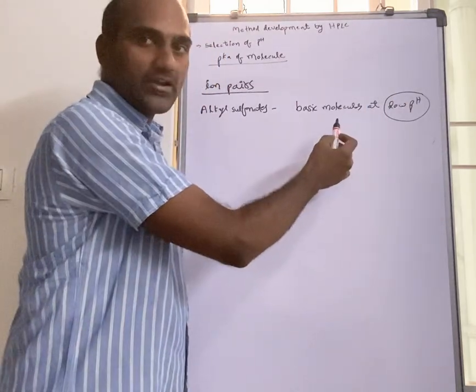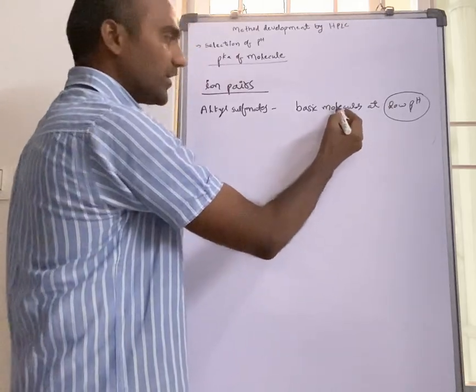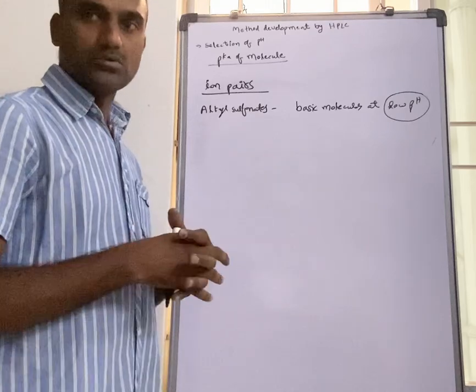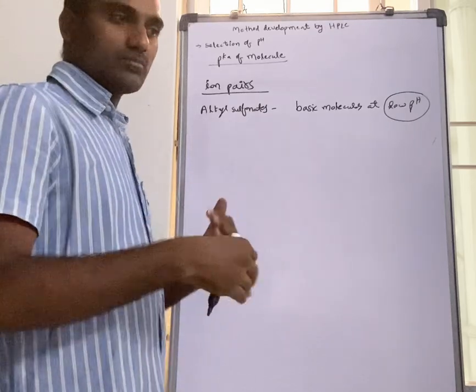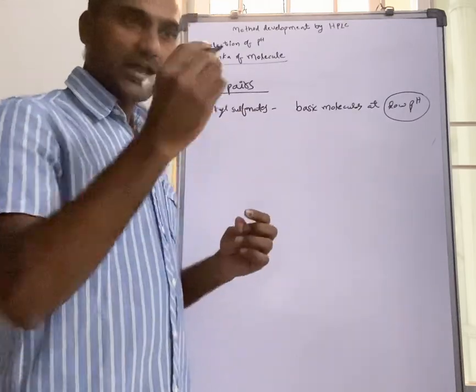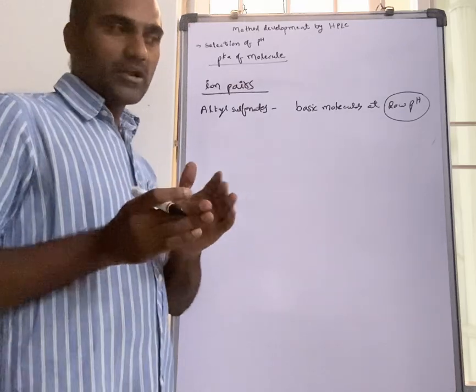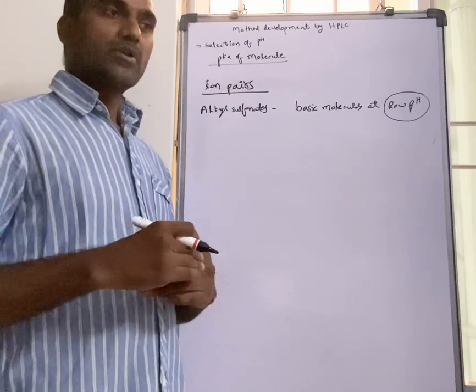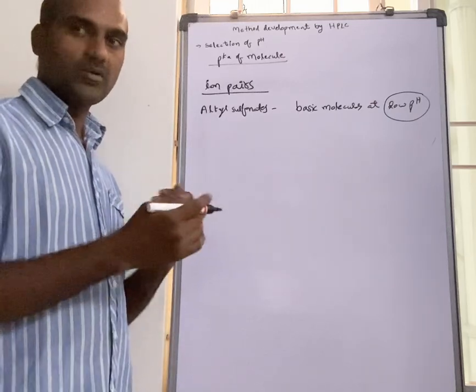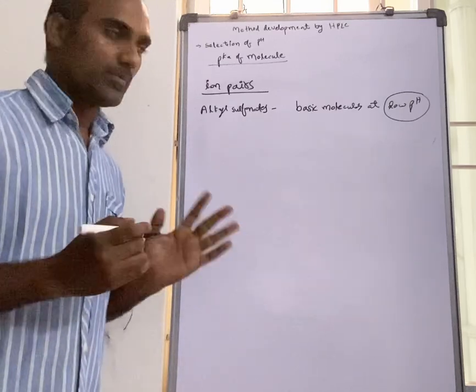So why I mentioned that at low pH? Basic molecules will ionize at low pH. So this will ionize and combine with alkyl sulfonates and form a new molecule, means this alkyl sulfonate will attach to our drug substance and form some bulky group, and it will impart some non-polarity to the molecule, and in a single unionized state it will be there. So then it will increase the retention and separation will be there.